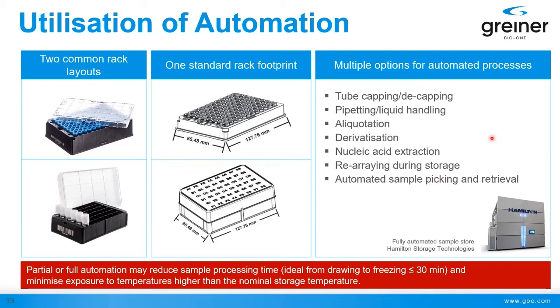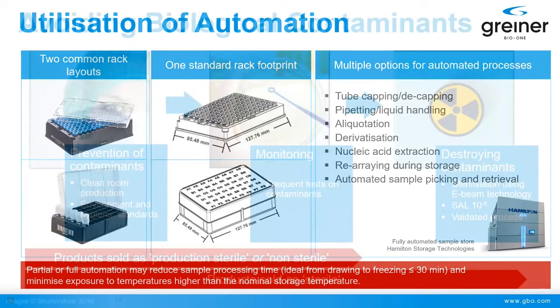In the store, exemplified here by a Hamilton BioStorage system, these large freezers, so to say, there is still automation going on on the inside of the devices. Samples are retrieved, racks are semi-full, half empty, and then you can do the consolidation. All this can be done automatically. It's really fantastic what is possible today, but it all goes back to automation-friendly labware formats.